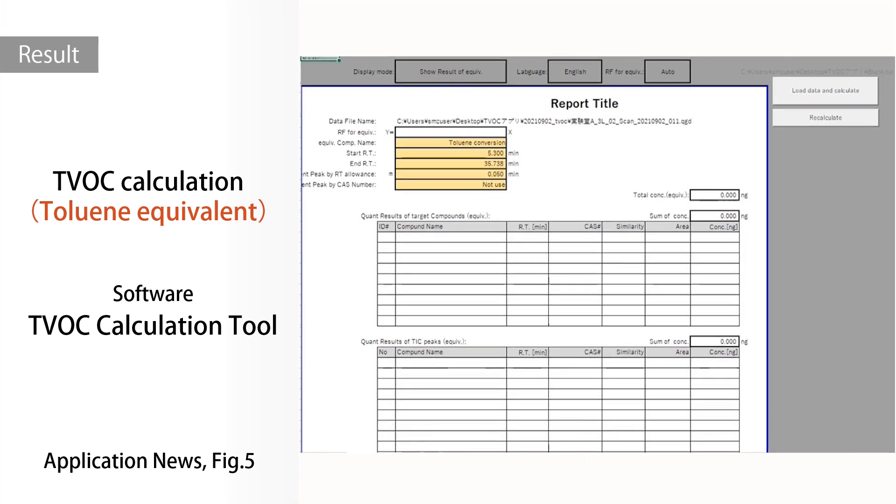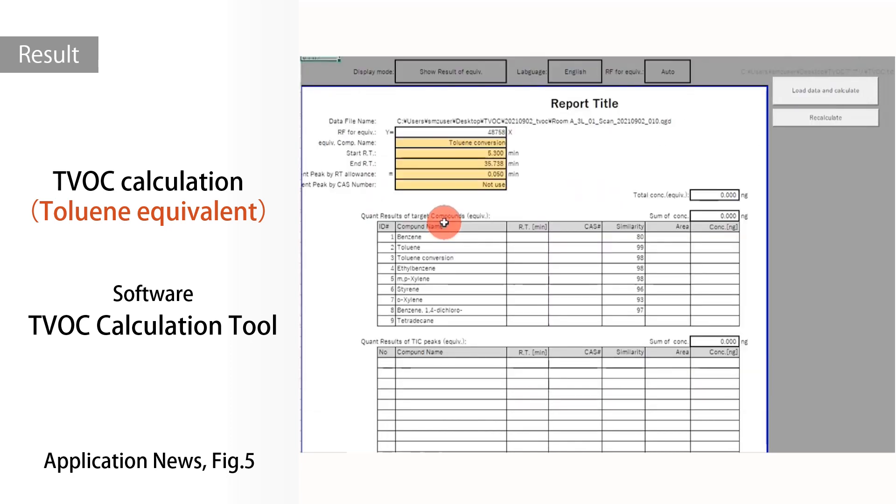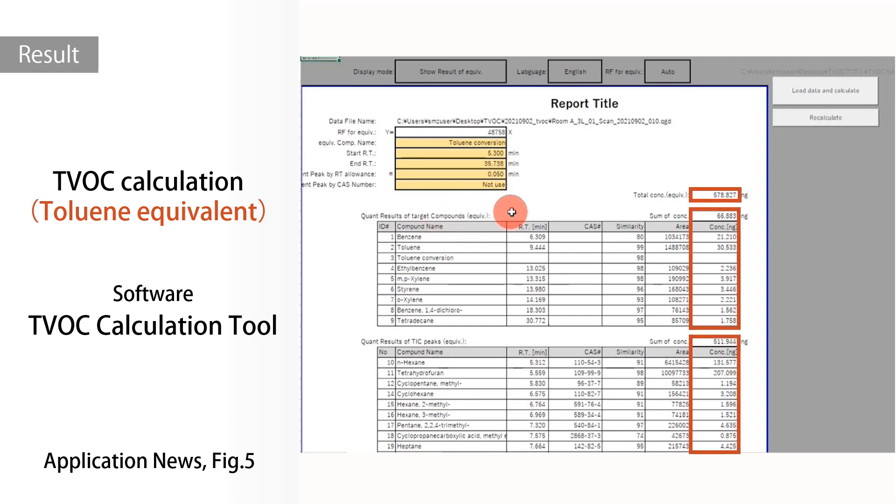The CSV file was then loaded onto TVOC calculation tool. The conversion of TVOC data to toluene-equivalent concentration was automatically performed by the tool.